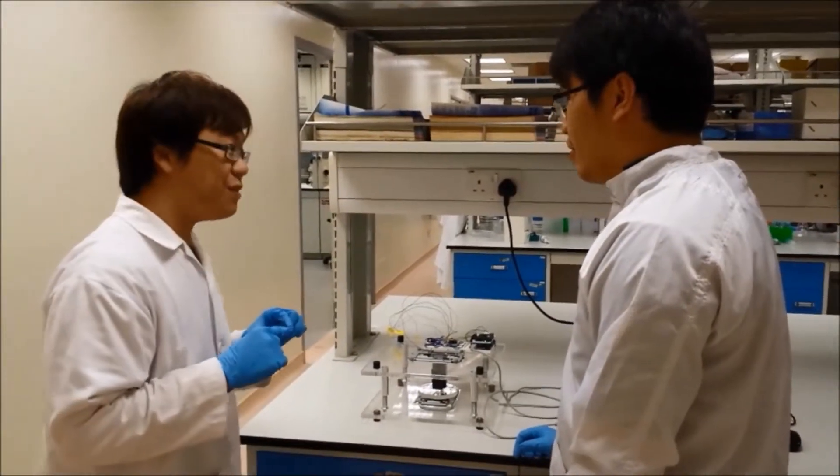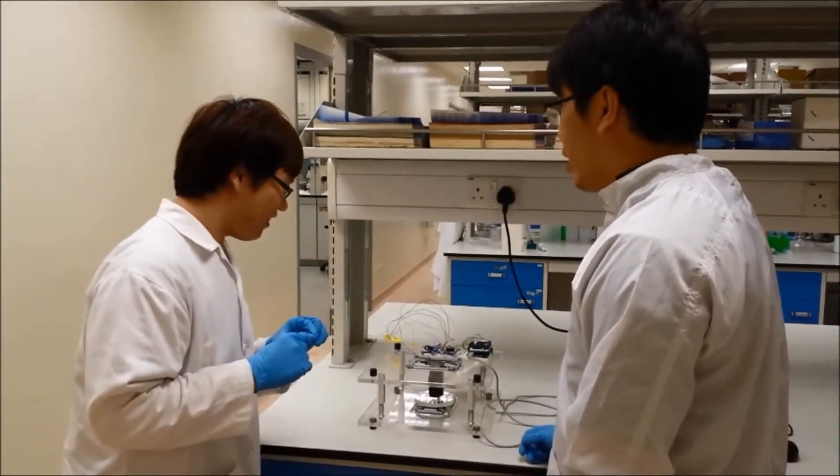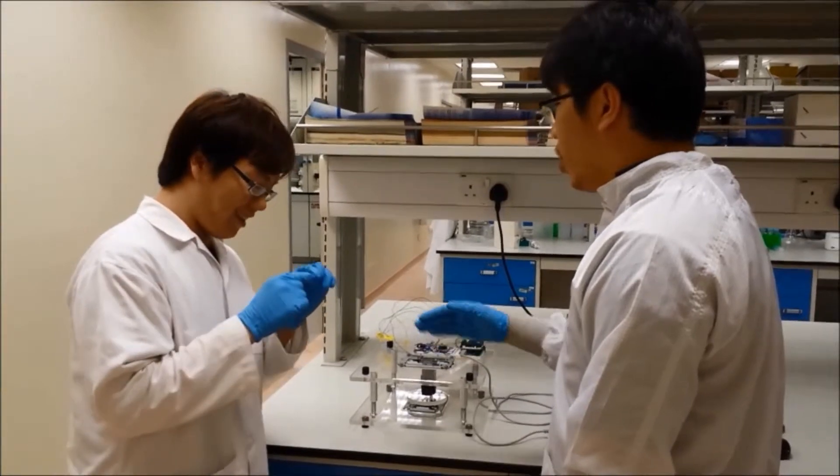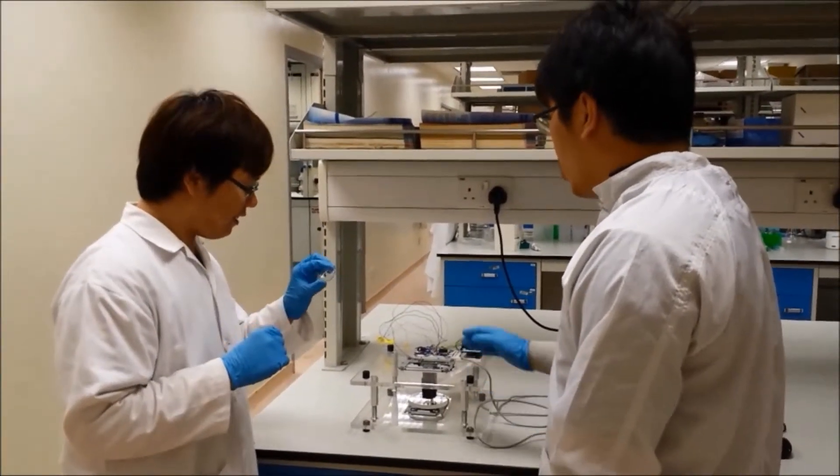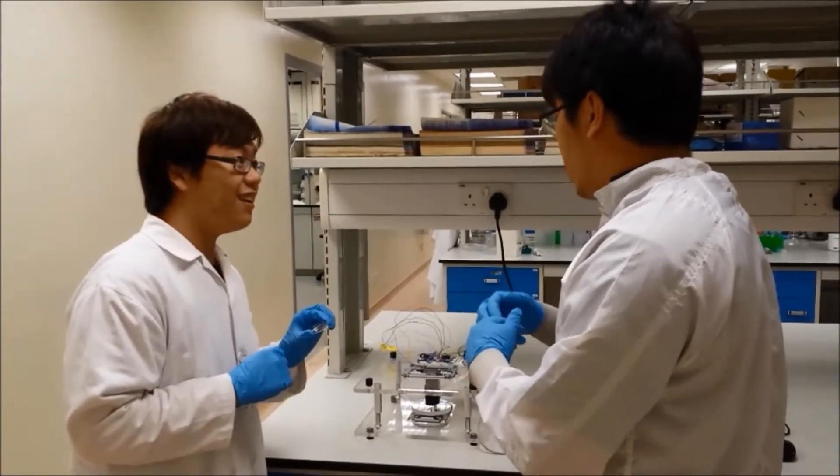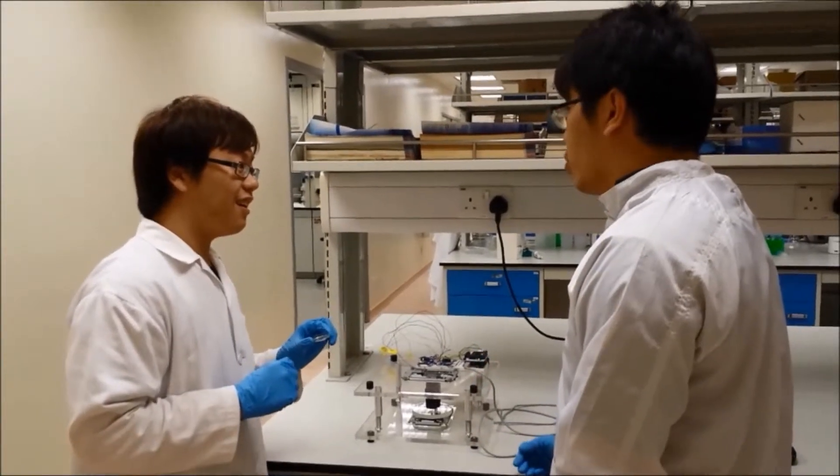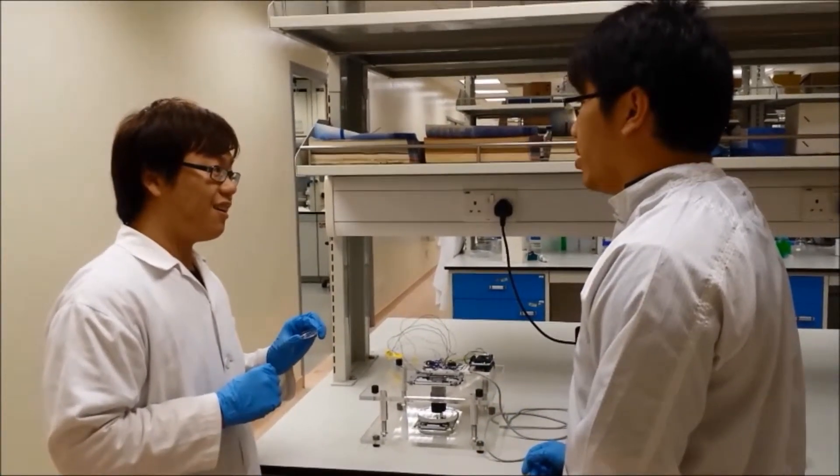So how does the bioprinter work? Basically, there will be calcium chloride in the ink cartridge and there will be alginate on the printing platform. So when these two chemicals come into contact with each other, they will form our hydrogel. That's the mechanism behind it.